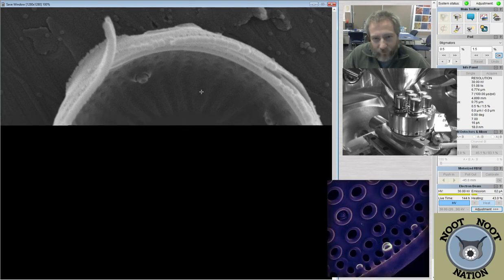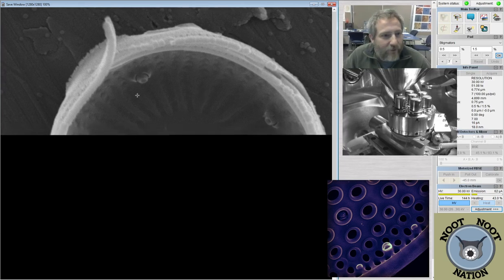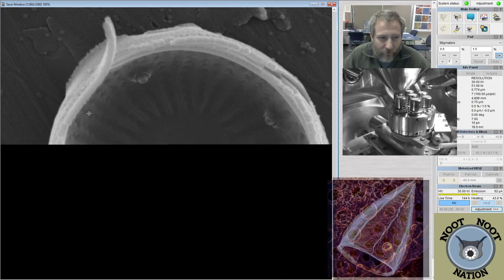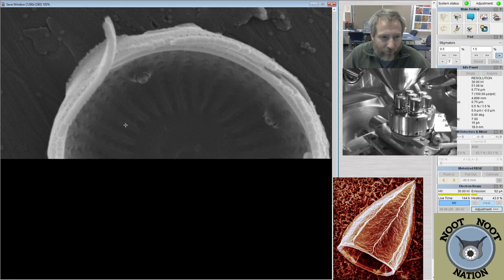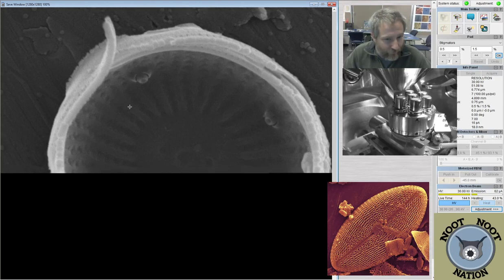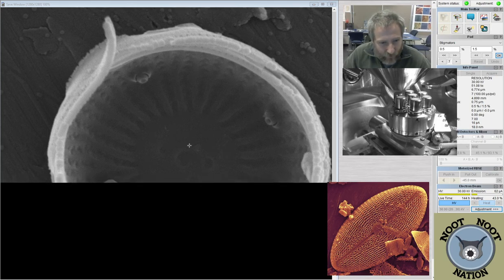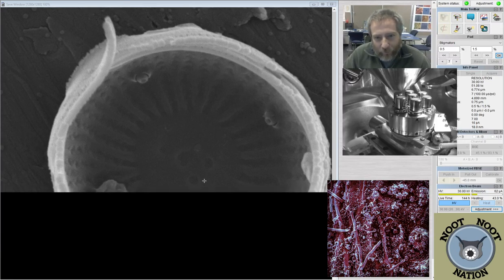And you'll note I didn't give this thing a name. I suspect it's a Stephanodiscus, but I'm not totally sure. It looks like there's biseriate striae, but there's also some sort of a ridge right here. And these sort of costi-like ridges are not common for Stephanodiscus, so that means it's probably Cyclostephanos rather than Stephanodiscus. But I couldn't really see the central area to see what was going on here, so I didn't want to put a name on it.